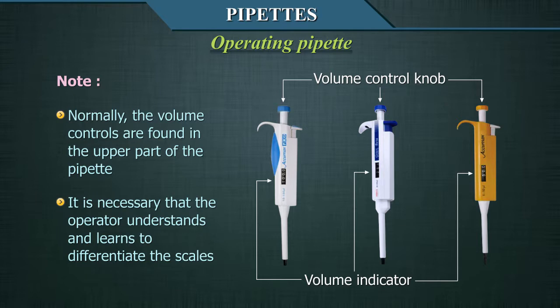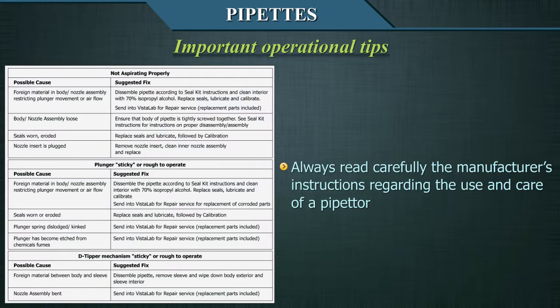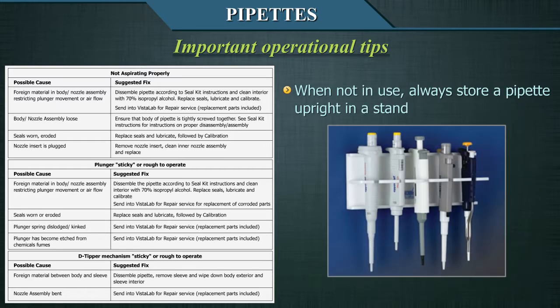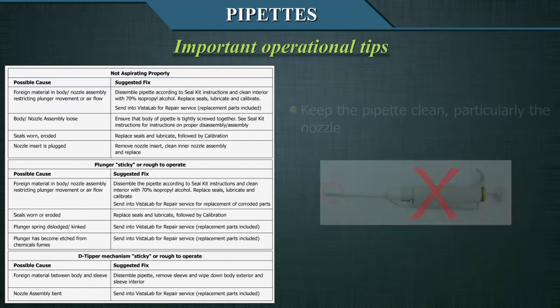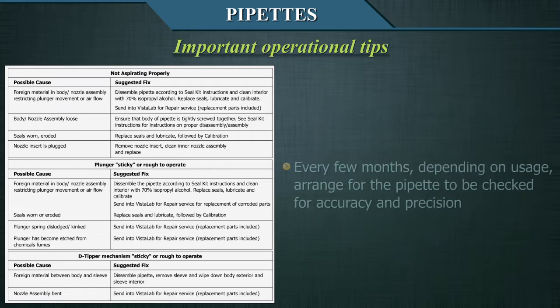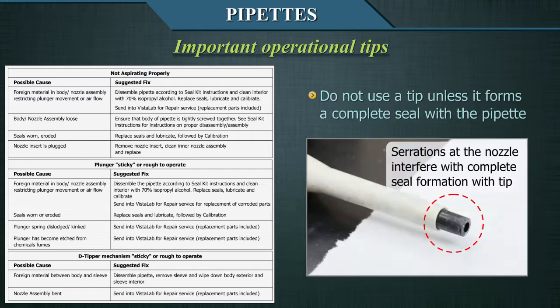Some important operational tips: always read carefully the manufacturer's instructions regarding the use and care of a pipetter. When not in use, always store a pipette upright in a stand. Never leave a pipette on its side when a tip is attached and contains fluid. Keep the pipette clean, particularly the nozzle. Every few months, depending on usage, arrange for the pipette to be checked for accuracy and precision. Do not use a tip unless it forms a complete seal with the pipette.